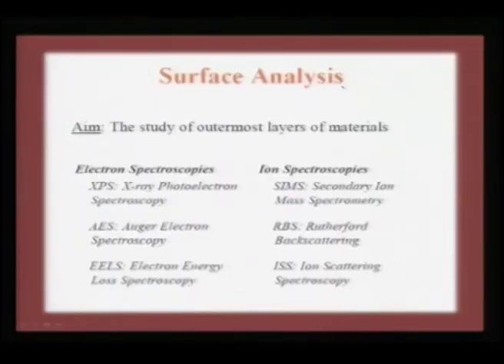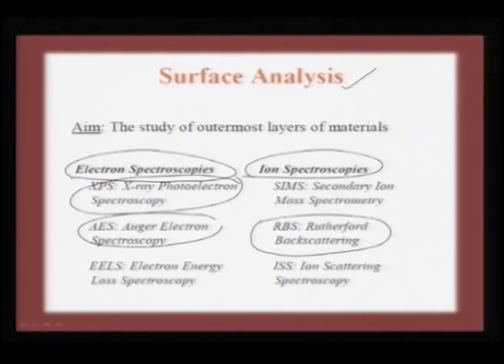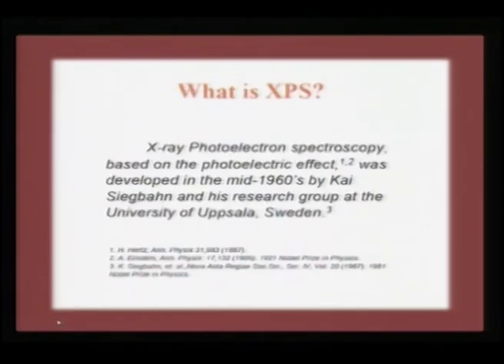In the last lecture I showed the same view graph, where I characterized two important techniques: one based on electron spectroscopies and one based on ion spectroscopies. Especially I talked to you about Auger electron and discussed in detail X-ray photoelectron spectroscopy, and gave you some idea about RBS, which is specially used to look at epitaxial layers and how thin films grow as single crystals.